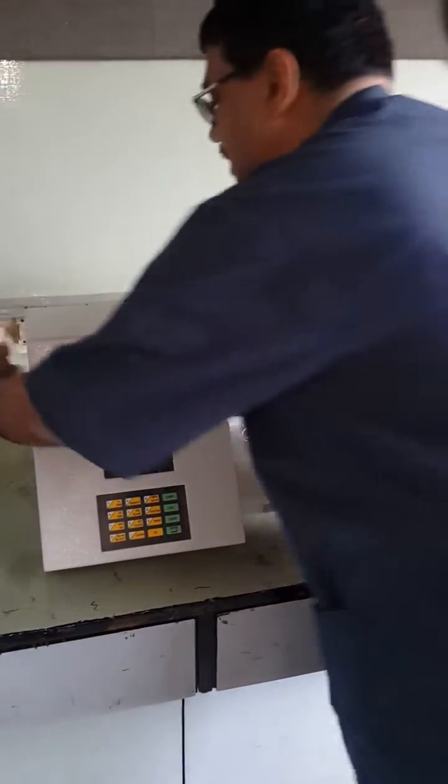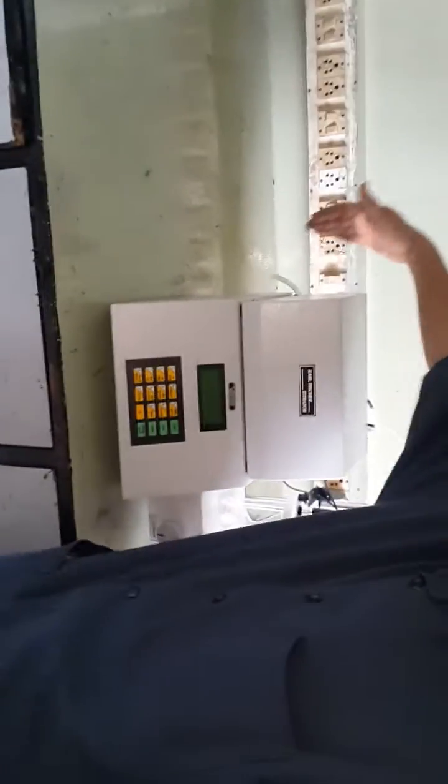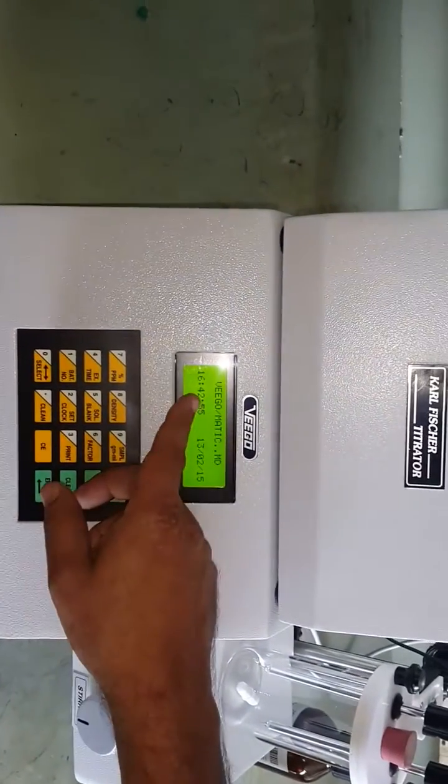Switch on the instrument by turning on the main supply. The main switch is mounted on the rear side of the instrument. When you switch on the main supply, the instrument will show the message 'Vigomatic MD'.